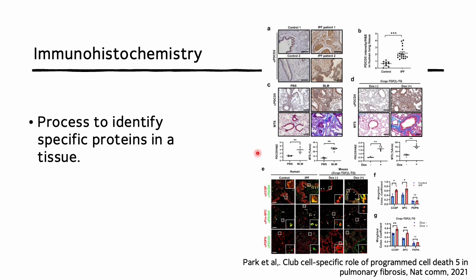And when you detect, we used a colorimetric process to have this image, but if you attach fluorescence dye, you can have this fluorescence image.